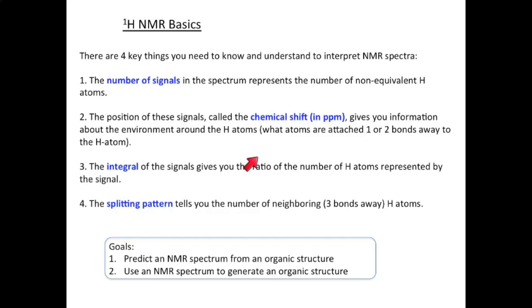So in this video we're going to go through all four of these aspects. Again, we're looking at Proton NMR. Carbon-13 NMR is a little different. You don't need to know all of these four aspects for it, but this video is really focused on Proton NMR.